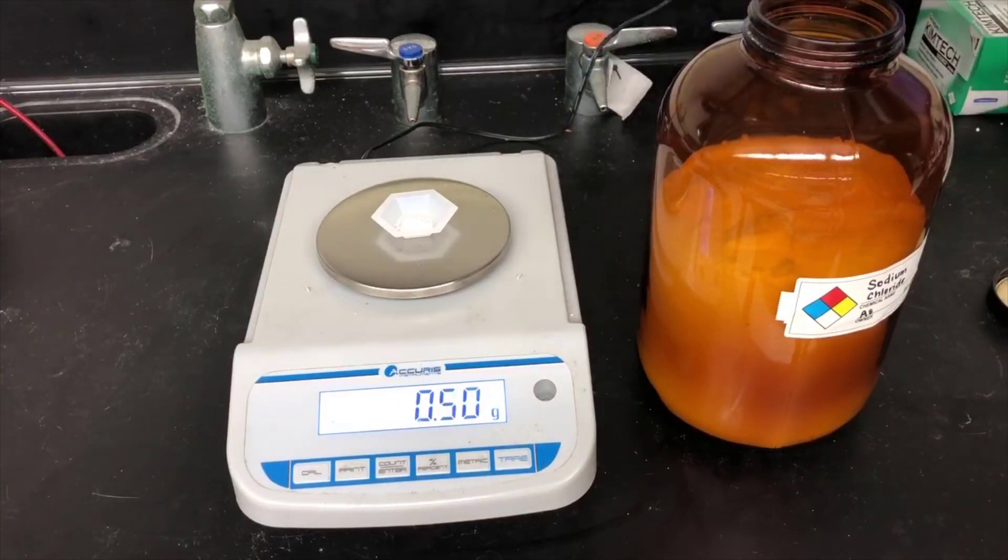You don't need to weigh out 0.50 grams of sodium chloride exactly. Just get as close as you can.